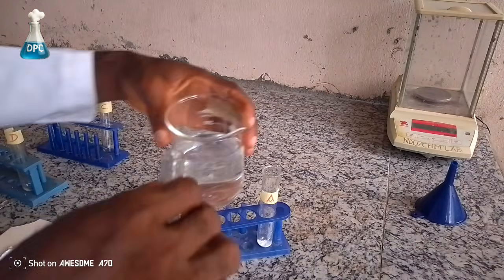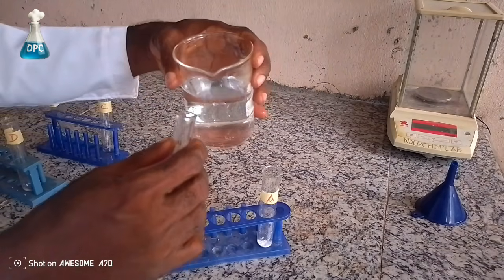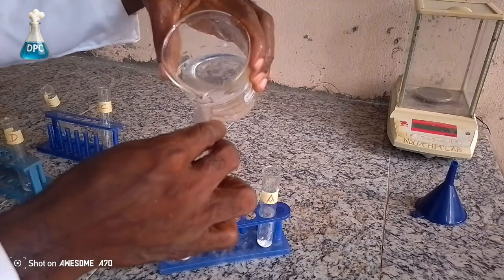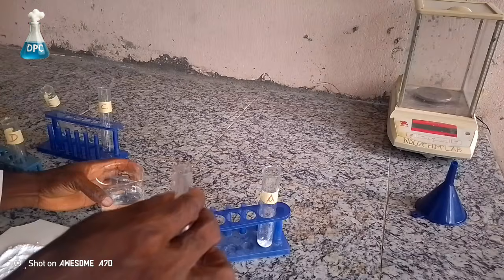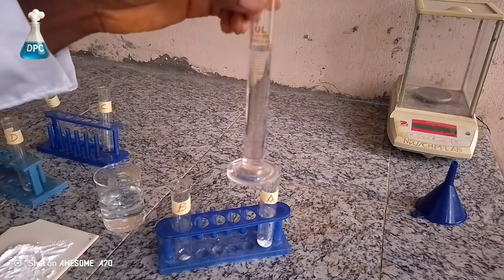After measuring the sodium hydrogen carbonate into the test tubes, we'll now measure 10 ml of water into each of the test tubes A, B and C to make solution of the sodium hydrogen carbonate. I want to dissolve the sodium hydrogen carbonate to make true solution.